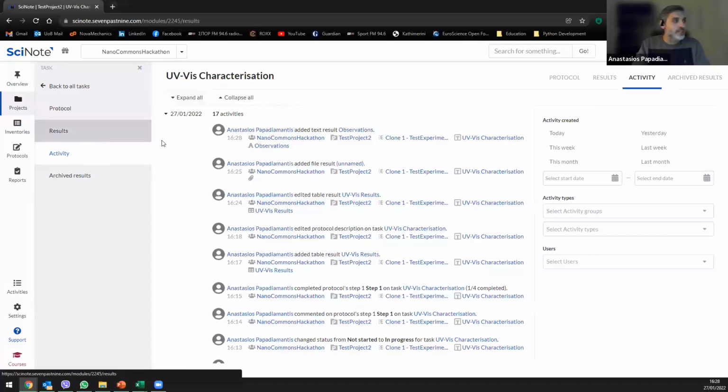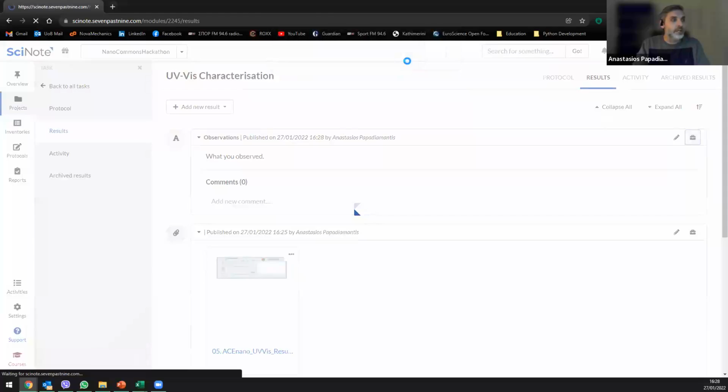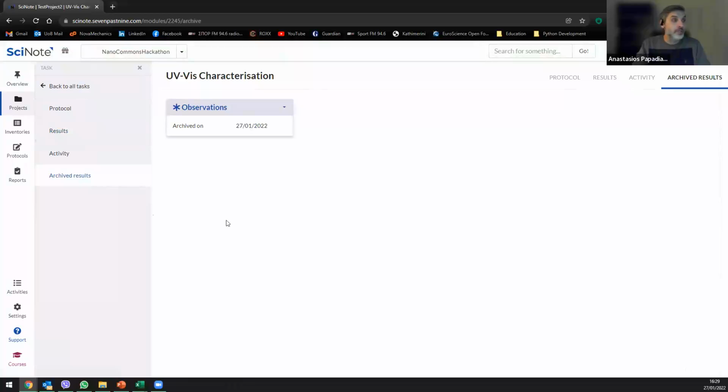Just to show you, as I said, if you're in the results section and you archive your results, it goes away from your main window, but it will be here. And from here, more or less, you can download, etc.